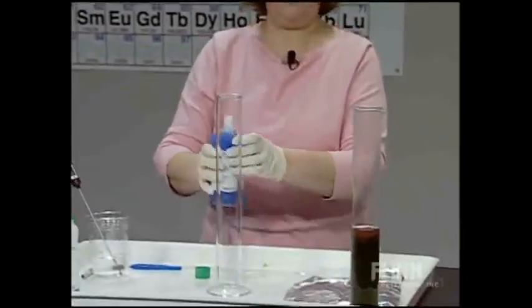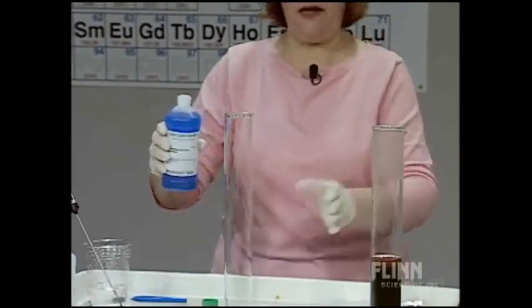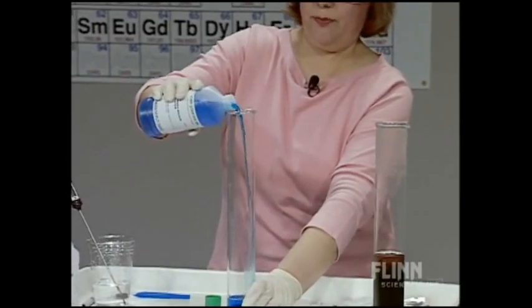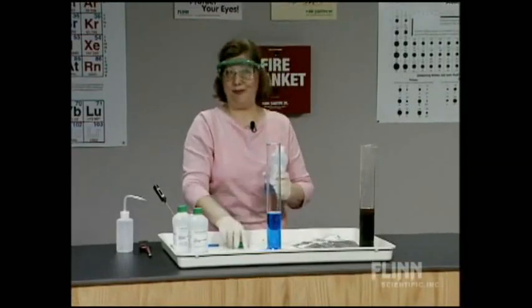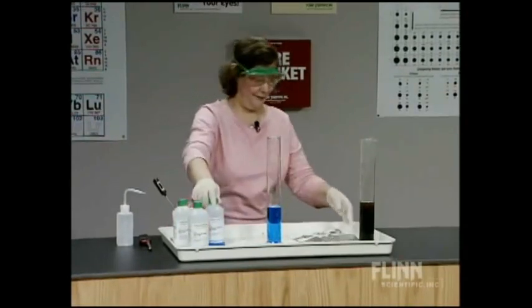So I'm going to try it with some copper sulfate just to prove that, in that single replacement reaction, the identity of the anion doesn't matter, because that's what we teach our students. So this one, I'm going to pour just about a third full rather than a half for a reason that's going to become apparent. So I'm kind of leading you on here a little bit in terms of what you're going to see.